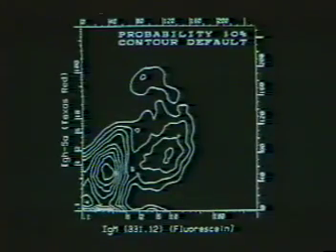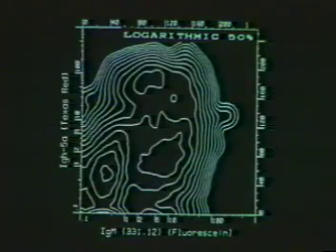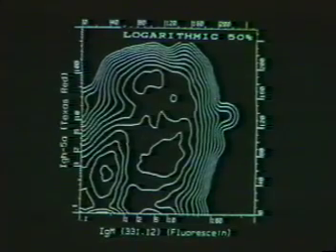To see more detail in a probability map, you lower the contour ratio. A 5% probability plot divides the mountainscape into 20 segments of equal cell data volume. The default contour ratio for a logarithmic map is 50%. In this case, raising the contour ratio increases the detail.